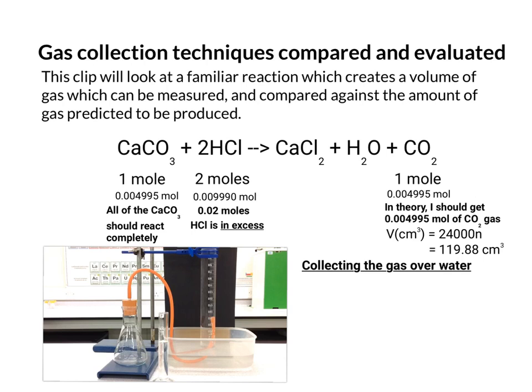So this first technique is called collecting the gas over water. So we have a conical flask as our reaction vessel. We also have rubber tubing fed underwater to a 250 centimeters cubed measuring cylinder. And the measuring cylinder is full of water with the end under the water that's contained within the plastic tray. So the inverted measuring cylinder filled with water should collect any gas produced. So let's now do the reaction and we can see what happens.